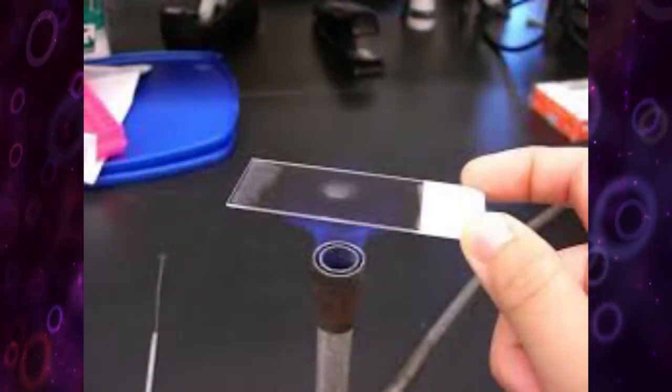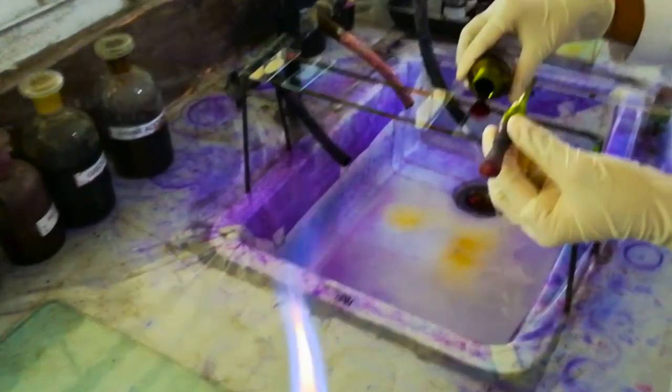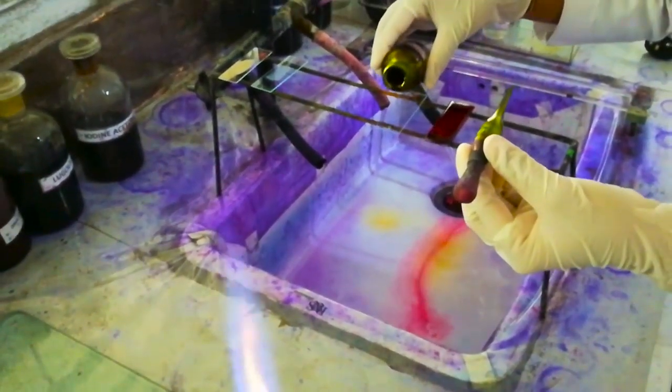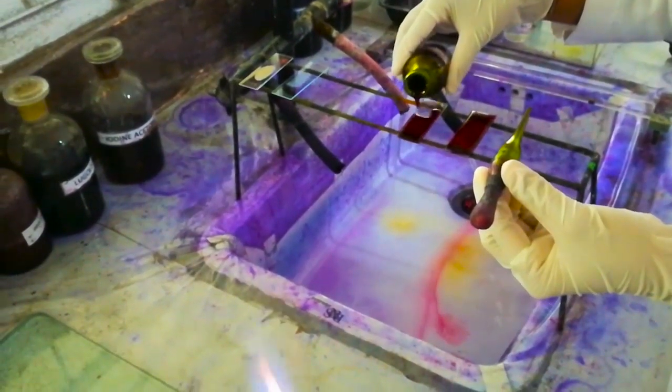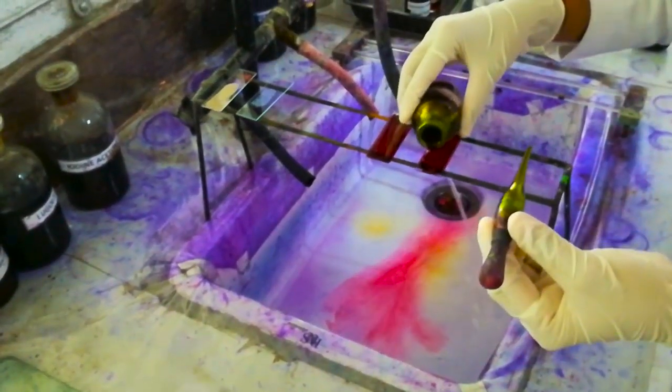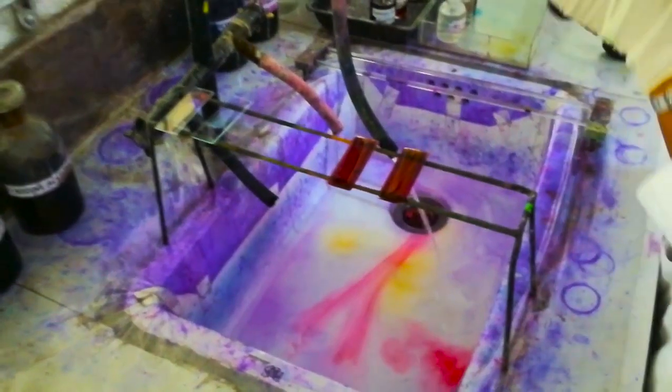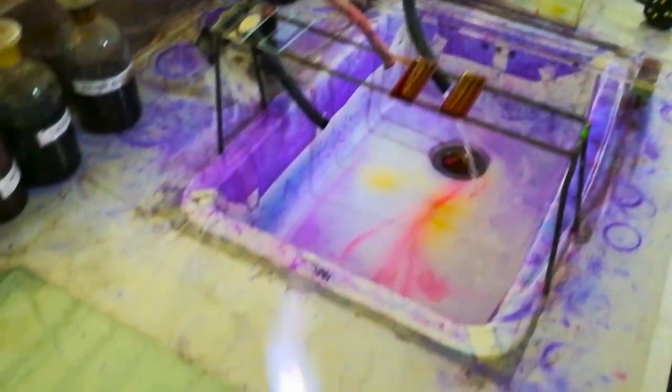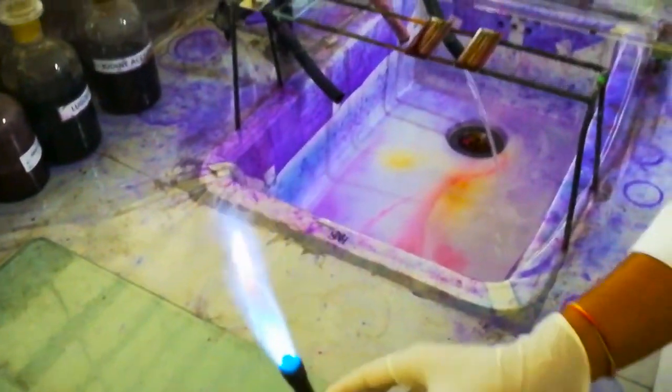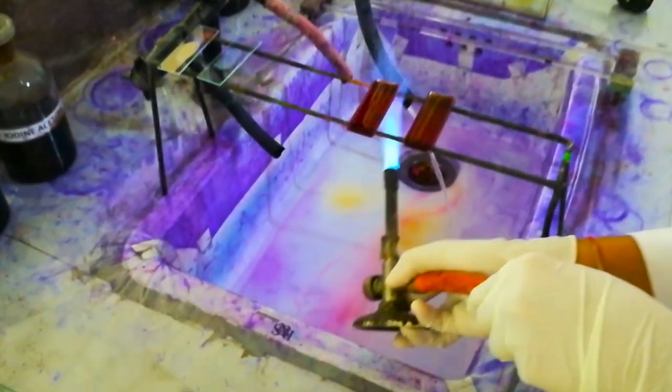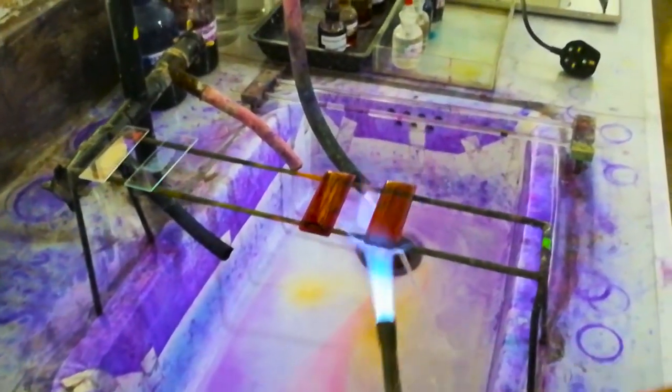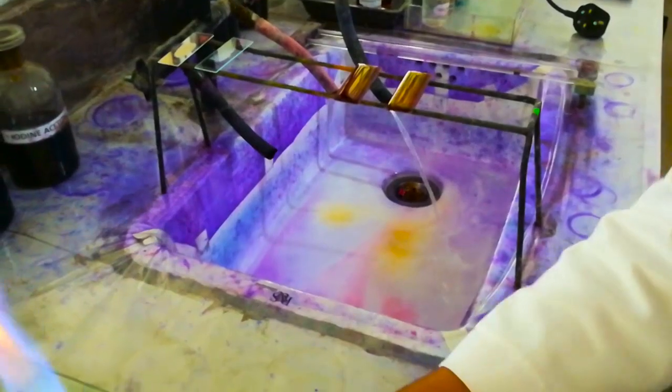Heat fix dried smear and cover the smear with 1% carbolfuchsin stain. Heat the smear until vapor just begins to rise, but should not overheat slides. You can add additional stain if necessary.